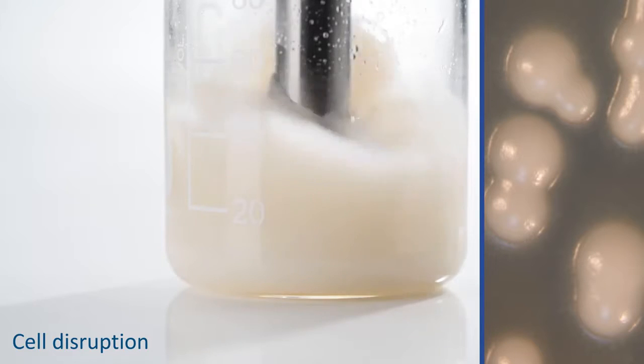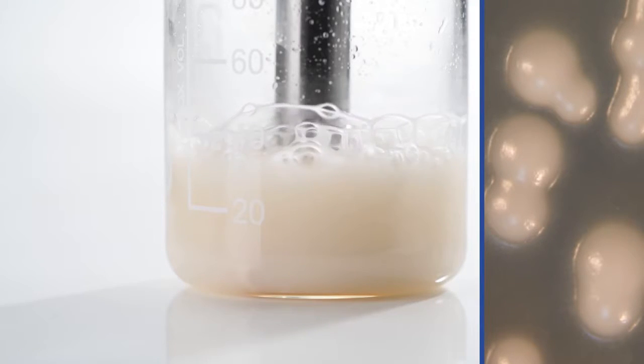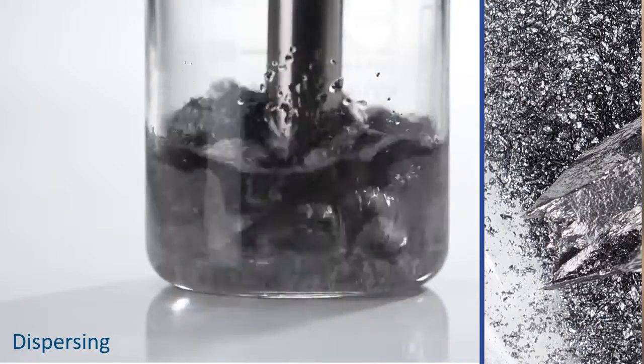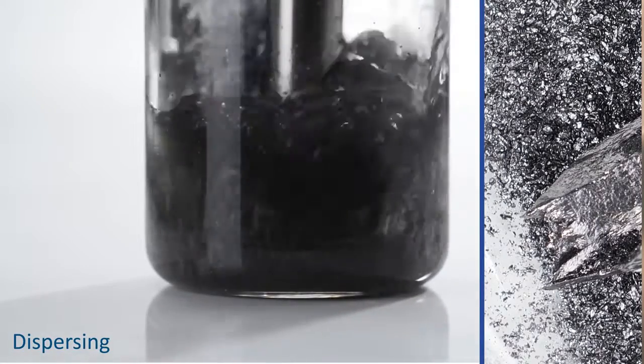Cell disruptions can be carried out quickly and precisely, without destroying cell content. Even demanding materials seldom require more than 3 minutes for optimal dispersion.